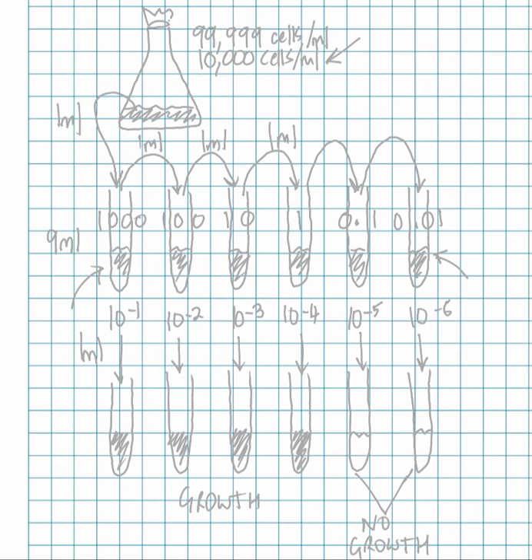Okay, I'm going to explain to you today the most probable number technique for working out how many bacteria you have in a culture. So let's start off with just a flask of bacteria up at the top here. There's our little flask, and it's got a stopper in there. And here's our culture. When you do the most probable number technique, what we're going to do is set up a series of tubes which we're going to inoculate using serial dilution. So I'll start off by drawing out the tubes here.